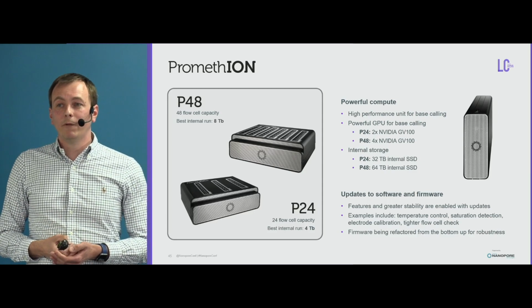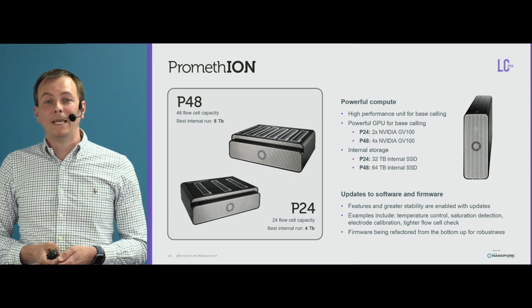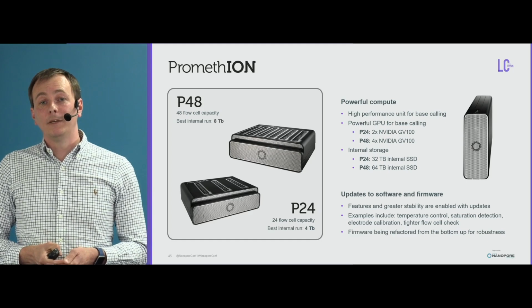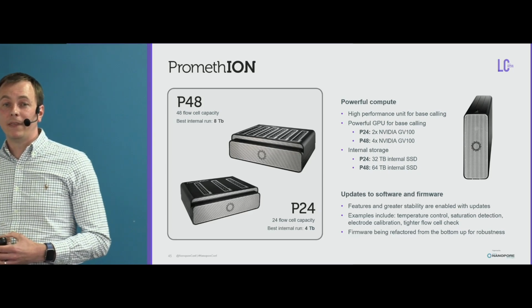So with regards to software and firmware, some of the things we've been working on are things like better temperature control of the PromethION, and that will give us higher outputs, more reliable outputs, and it can also affect base calling accuracy. So that's a real key thing.